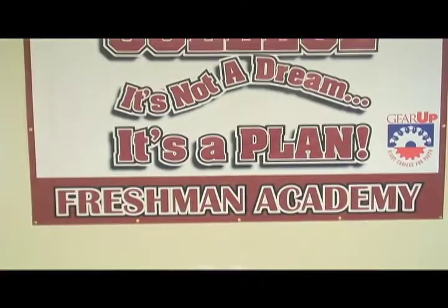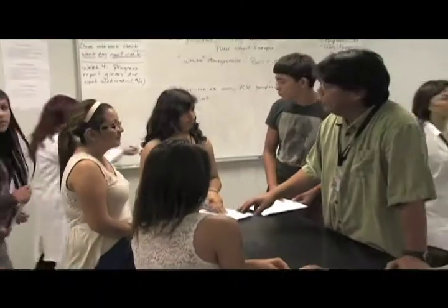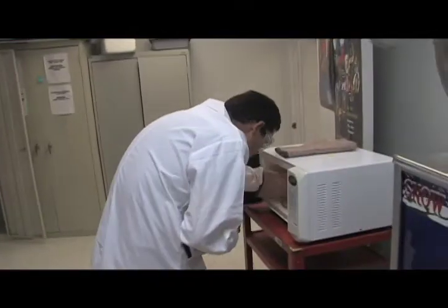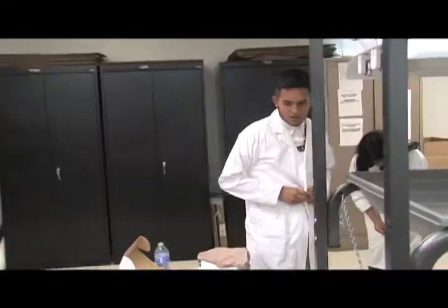Sunnyside Unified School District is utilizing technology to change the face of teaching and learning. At Sunnyside High School, bioscience instructor Stephen Ueda's students are using the latest technology in DNA barcoding and analysis.